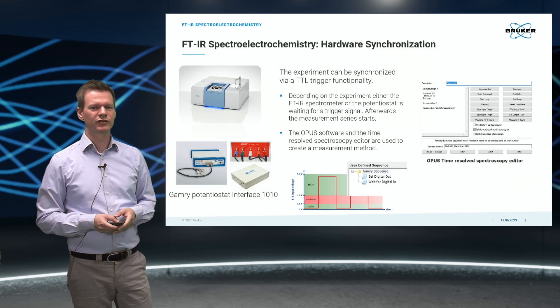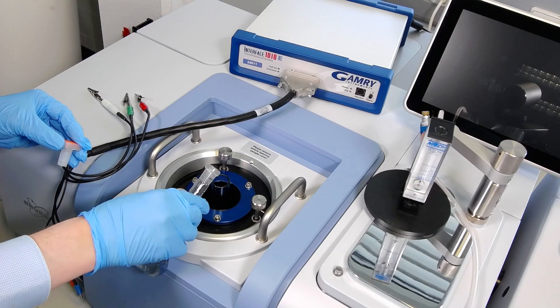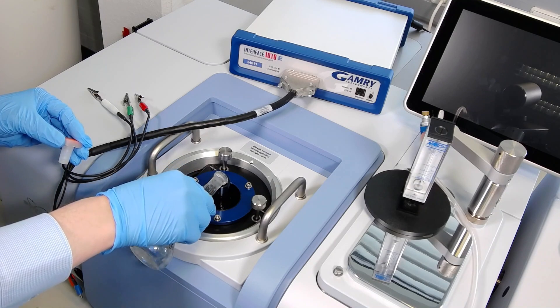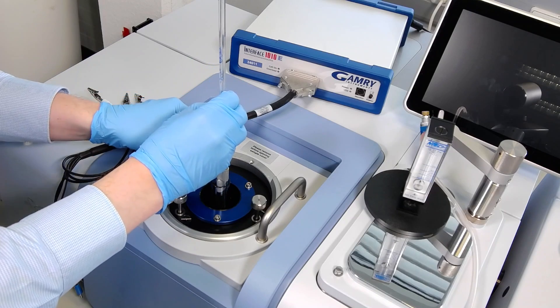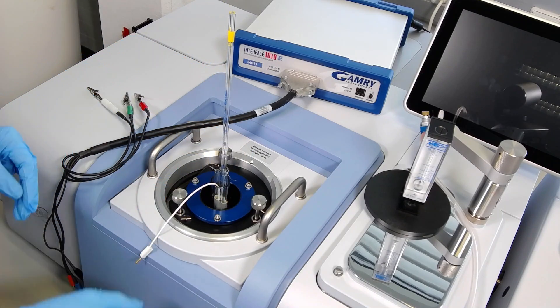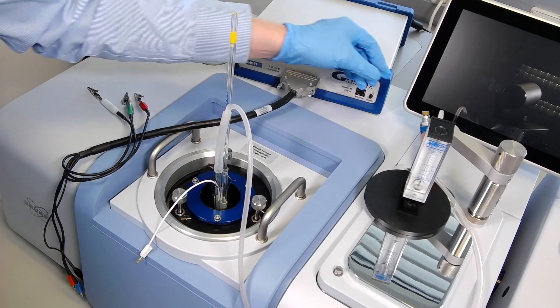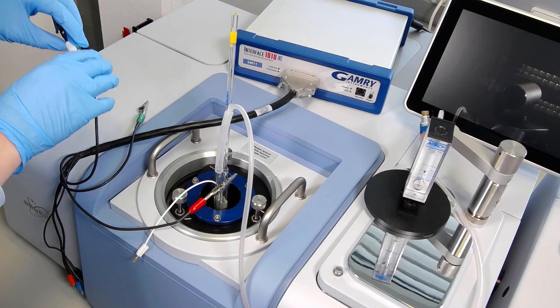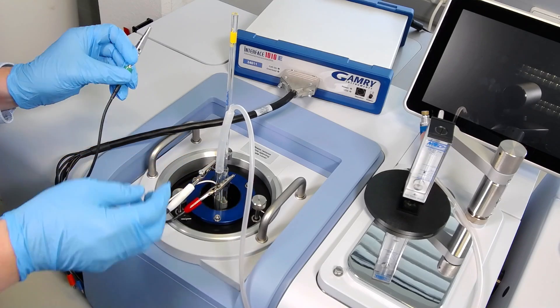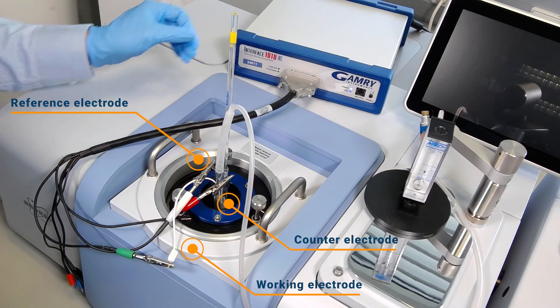After this information overview, let's look at the start of the IR spectro electrochemical experiment in the lab. The electrolyte solution containing the analyte is filled into the electrochemical cell. Afterwards, the set of electrodes is installed, consisting of a gold working electrode, a platinum counter electrode, and a silver pseudo-reference electrode. In addition, a nitrogen purge line is connected to free the electrolyte solution from dissolved gases like oxygen. The inert gas flows approximately 30 minutes through the solution before the start of the experiment. We can then connect the electrodes with the GAMRI potentiostat, which is switched on and establishes a USB connection. During the purging and waiting time, the methods can be set up in the software programs.